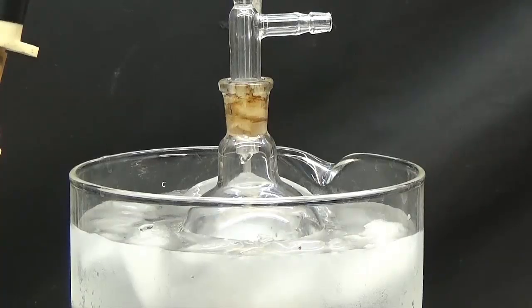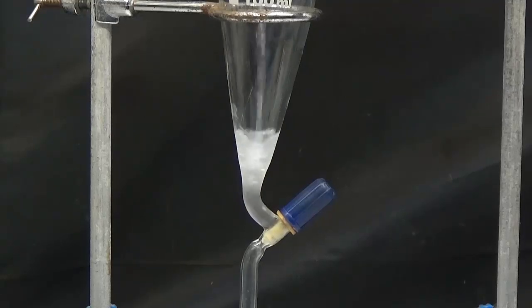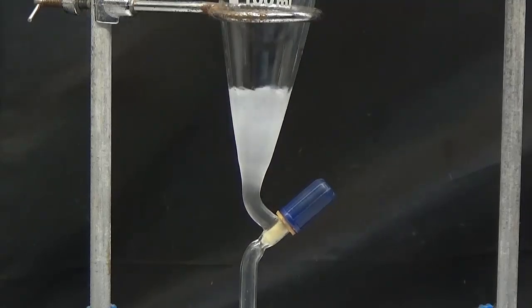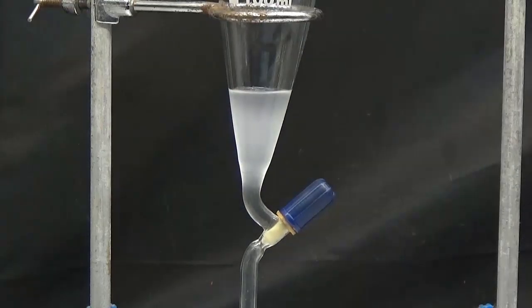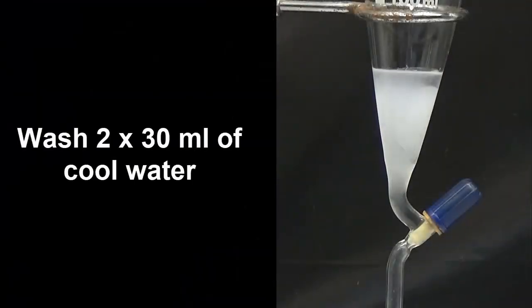The collecting flask was immersed in an ice bath to prevent evaporation of ethyl bromide. When no more ethyl bromide distills, the obtained product is placed in a 100 ml separating funnel. Wash twice using 30 ml of cool water.